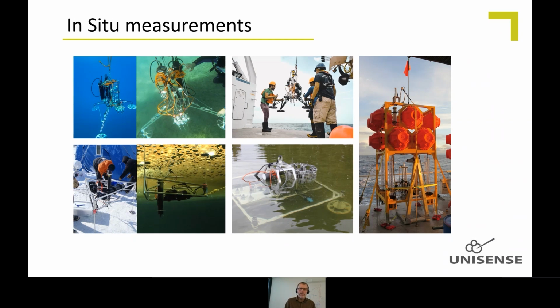So you can take the sensors out to the field. This was to a field station in the Arctic, but you can also take them underwater, and I will spend some time on that tomorrow. There's a whole presentation about what the sensors can do for you in situ, either from mini profiling and all at shallow waters or into the deep sea to 6 kilometers water depth on a free-falling lander.